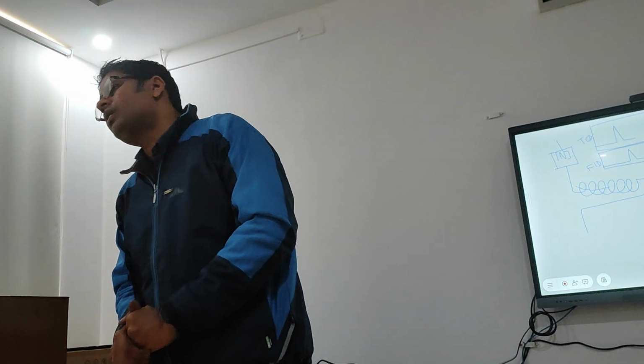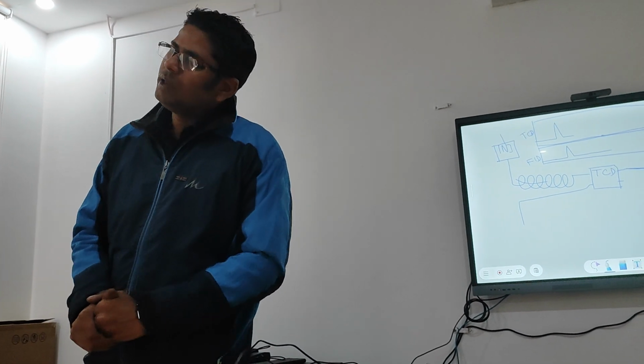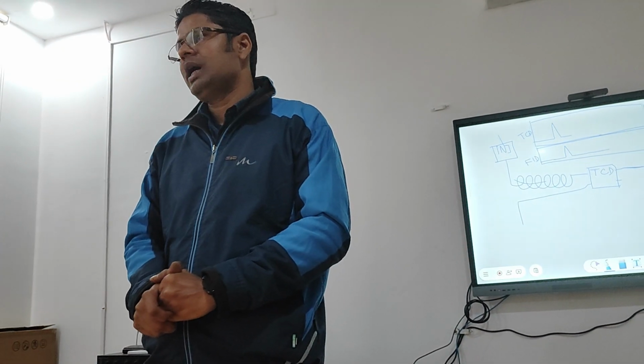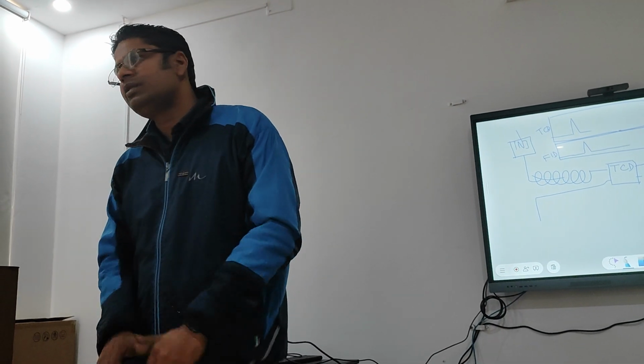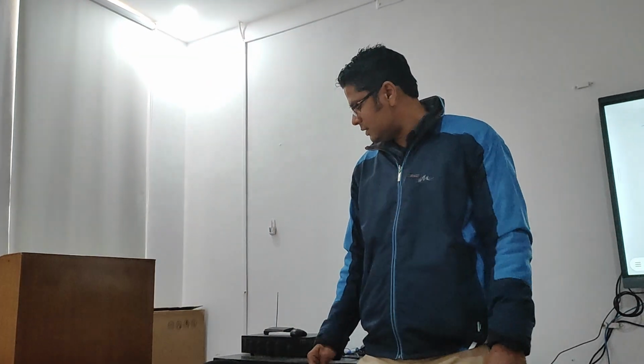If you are using a molecular sieve column, MS for short, you cannot inject CO2 because the molecular sieve column traps CO2. Your sample containing CO2 will be trapped in this column. Other components will elute, so your analysis will not be completed, and you will be confused about why one peak is not coming. If you do this repetitively, your column will be saturated with CO2, and it will be time to throw away the column. Your column will be damaged.